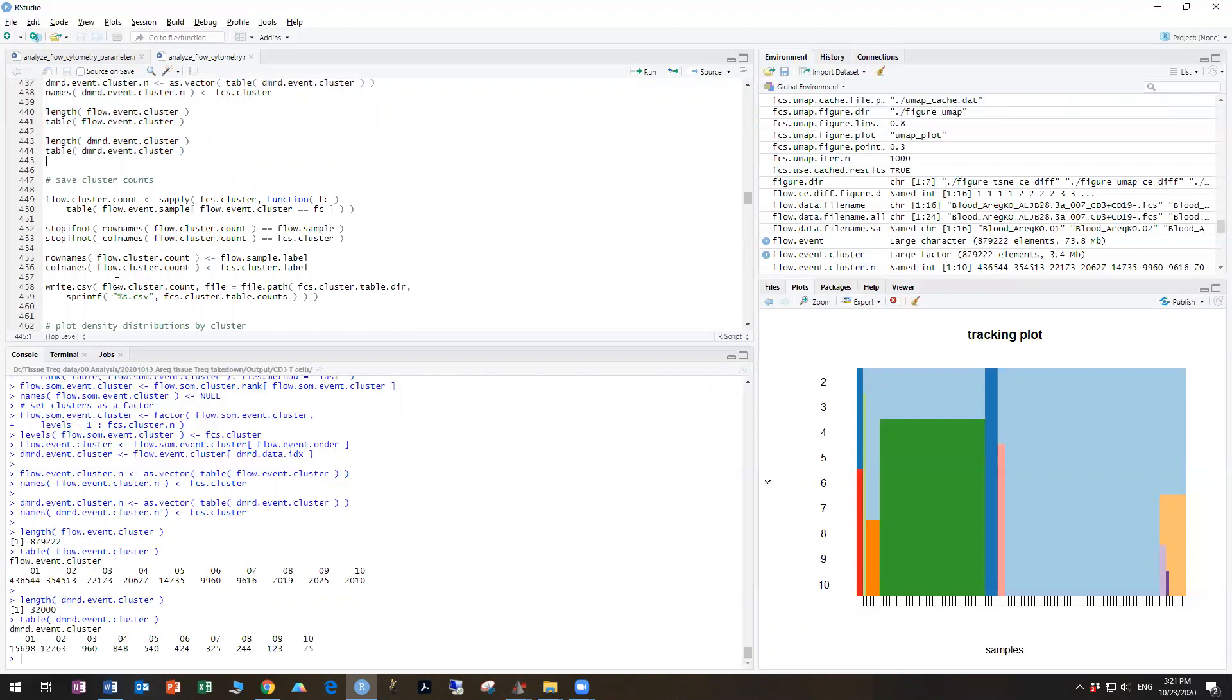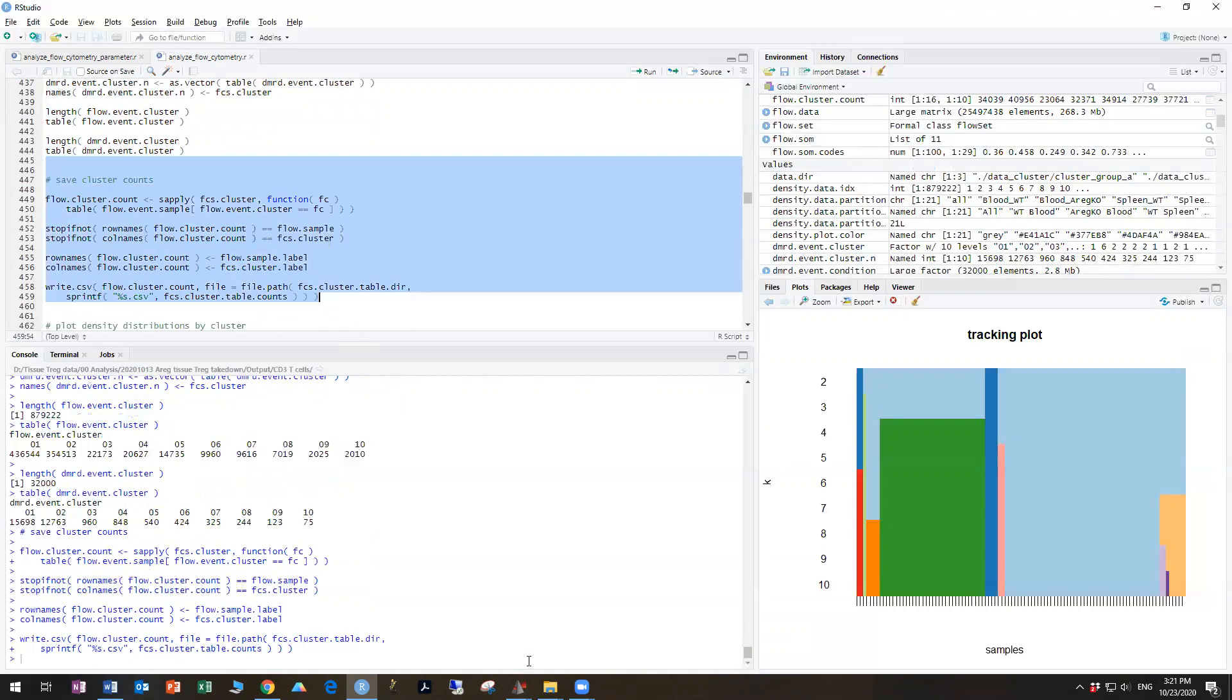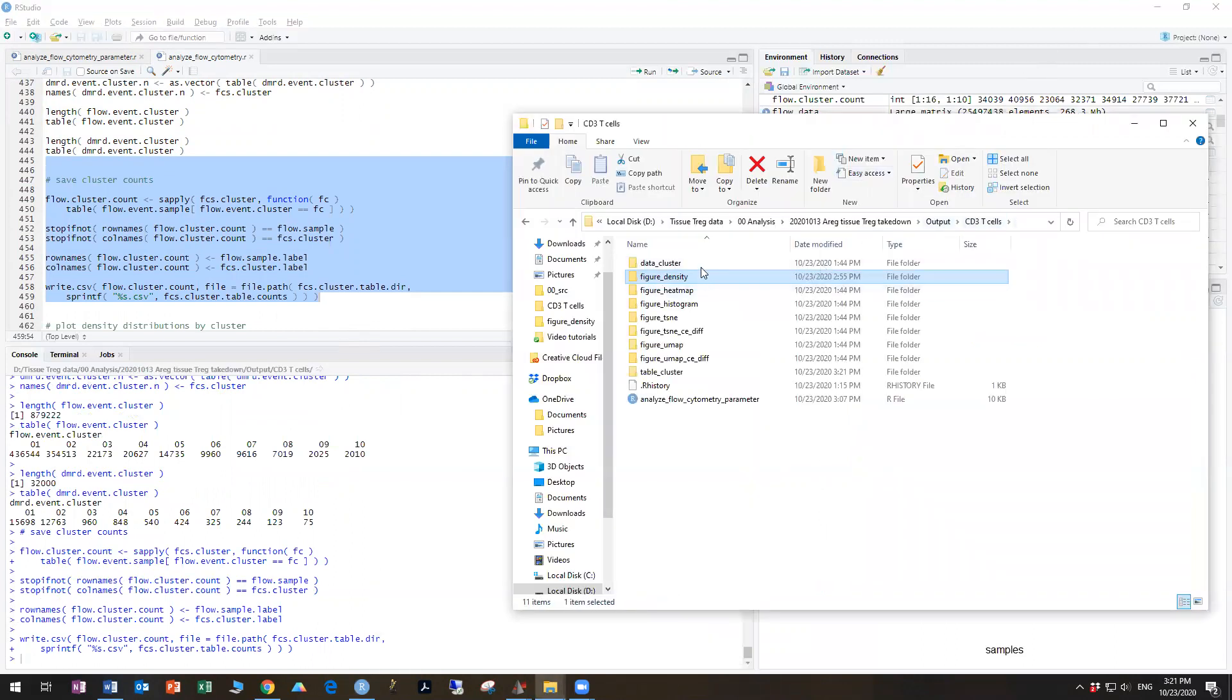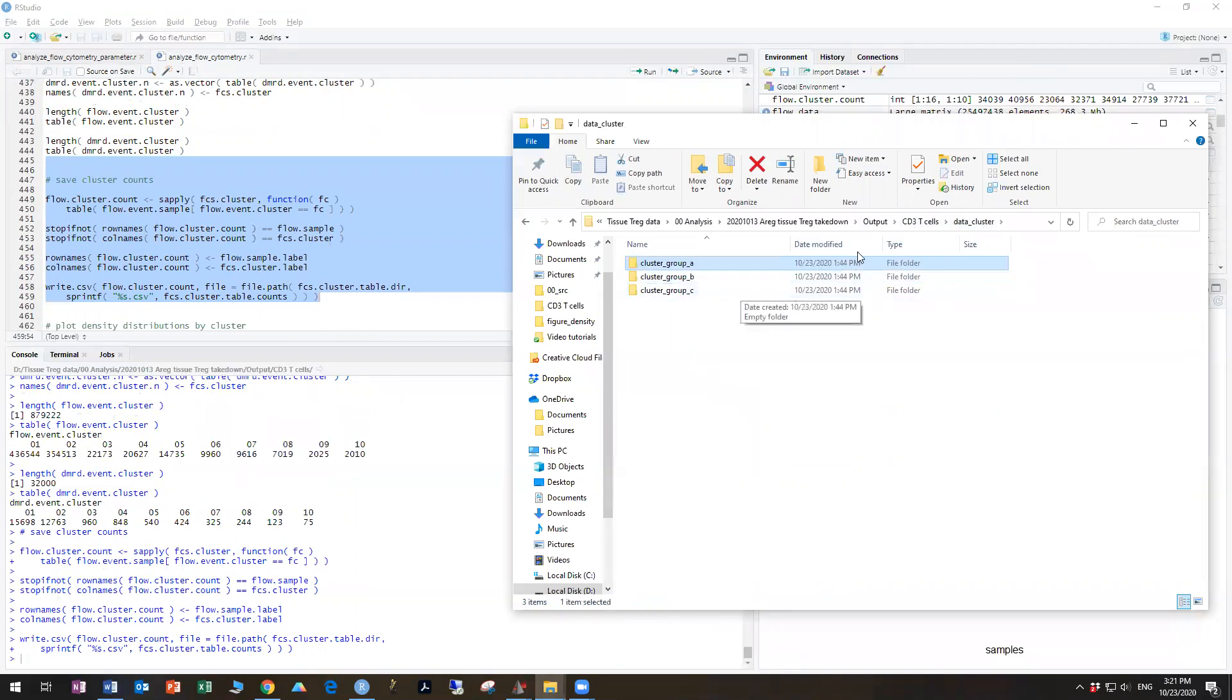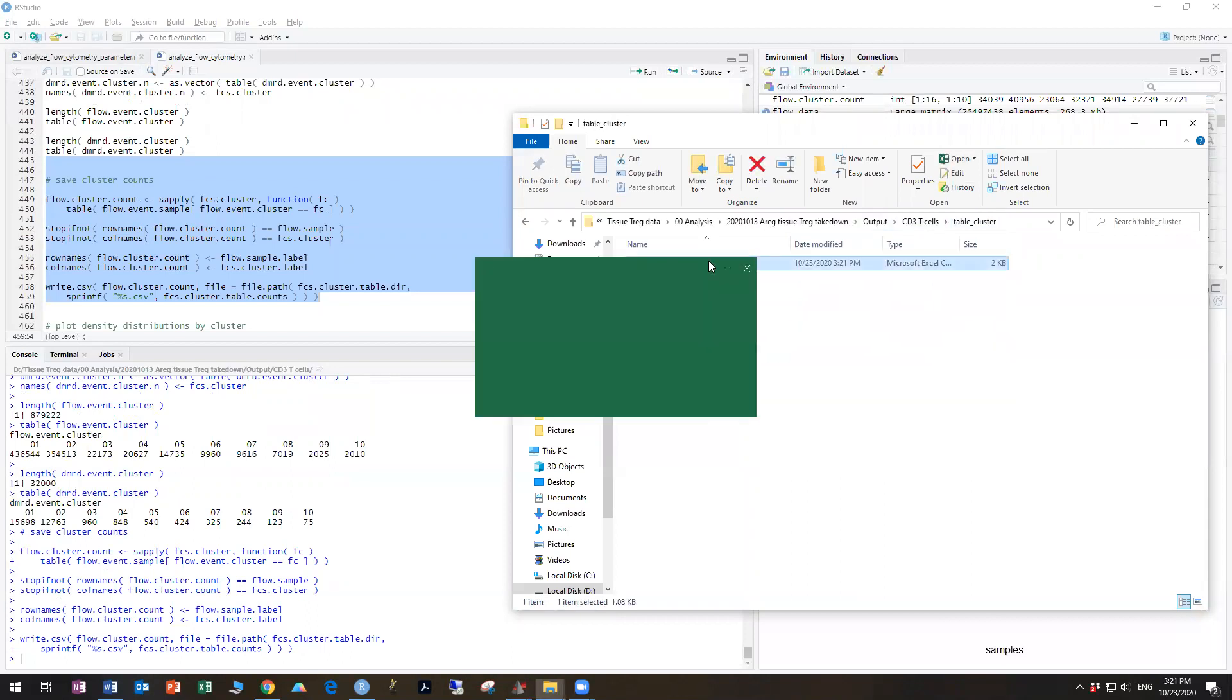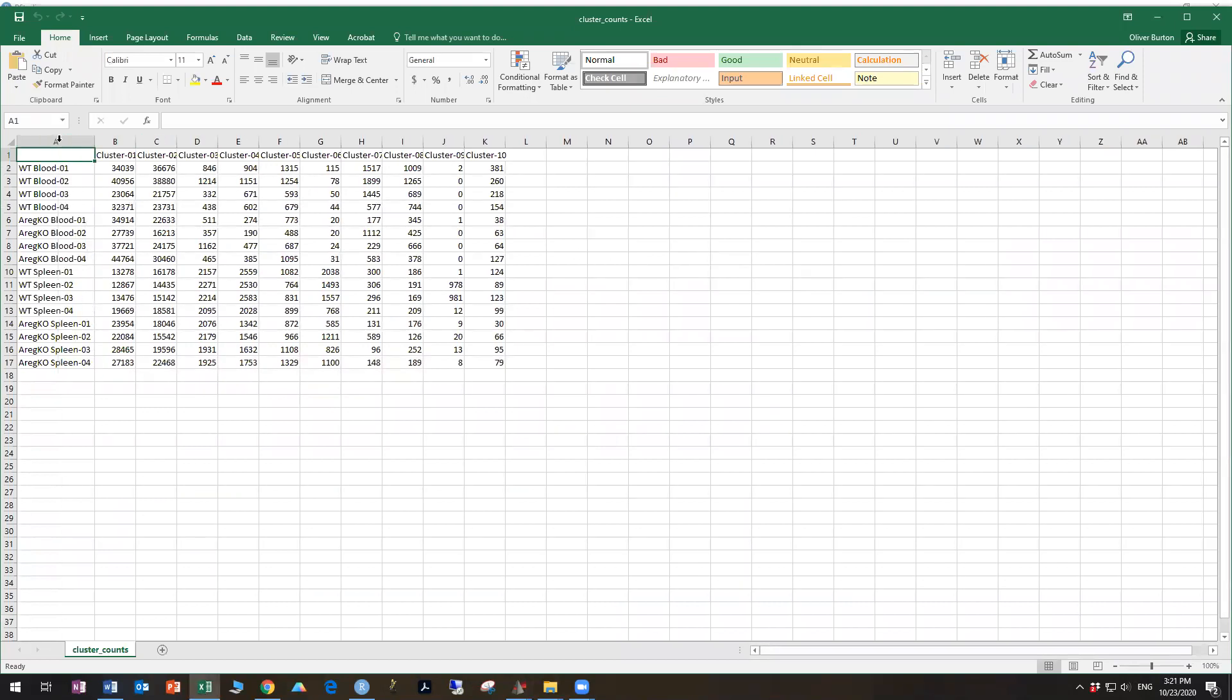All right, and now we're going to save the cluster counts, which outputs a CSV file into your output folder, which tells you about the frequencies of your data here. So these are the number of cells in each cluster in each sample, and you can see that cluster one is more common in blood than, say, spleen relatively.